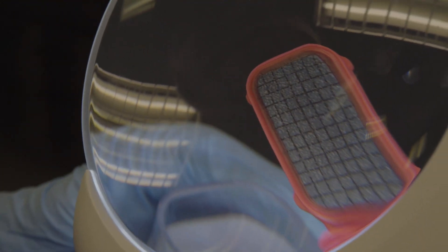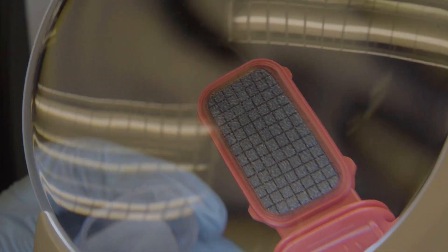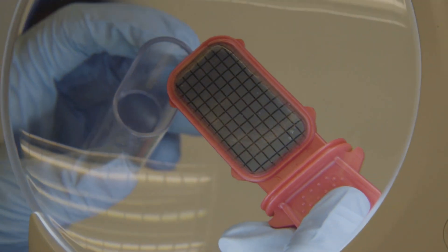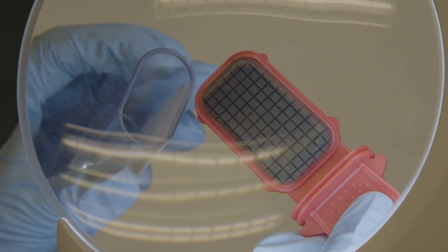Remember that size, colour and shape of dots don't matter. It is the total number of colonies that need to be recorded. This is your CFU count.